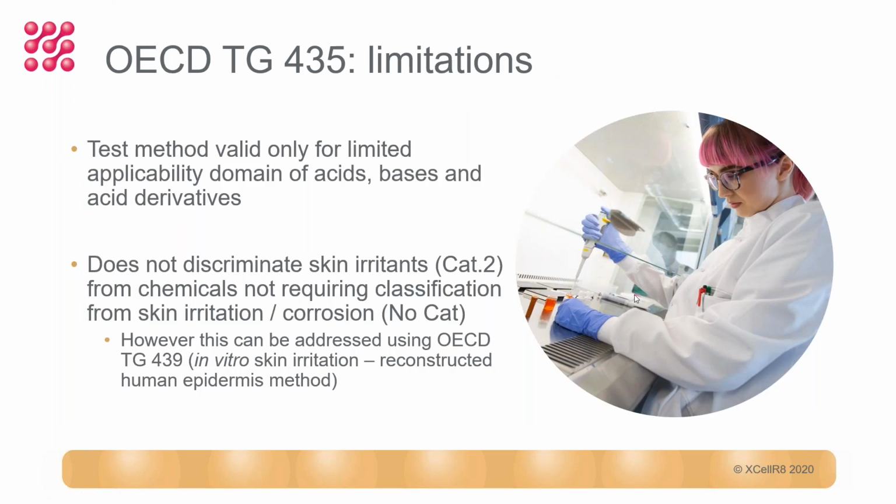So this test method, as we've said, is only valid for a limited applicability domain. As with the other methods, it doesn't discriminate between the skin irritants category 2 from no category, but you could go on to use Test Guideline 439 for skin irritation if you needed to go down that route. Next slide.